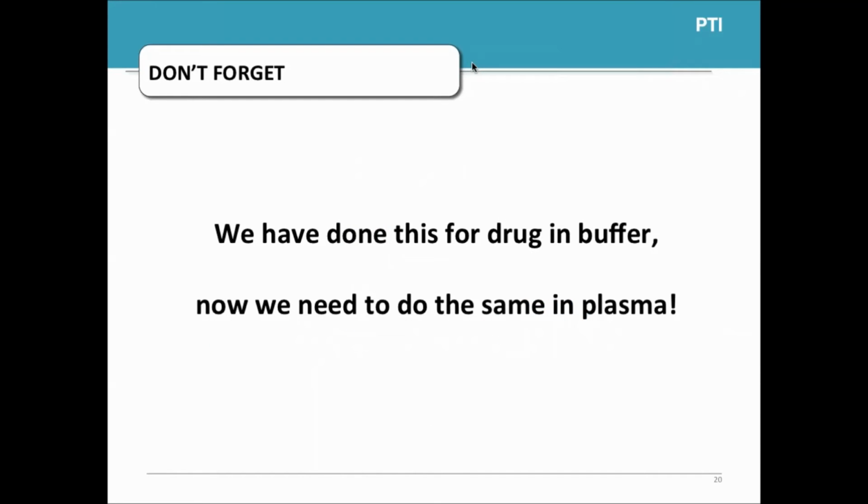And then realize that when we do assay development and feasibility, and a lot of times when we do potency assays, that is something different because we don't work with the drug in anything other than the actual formulation. But if you work in PK or immunogenicity, so you actually work with plasma samples or any kind of biological sample, you will at some point have to introduce actual matrix: blood, plasma, serum, any type of biological matrix.